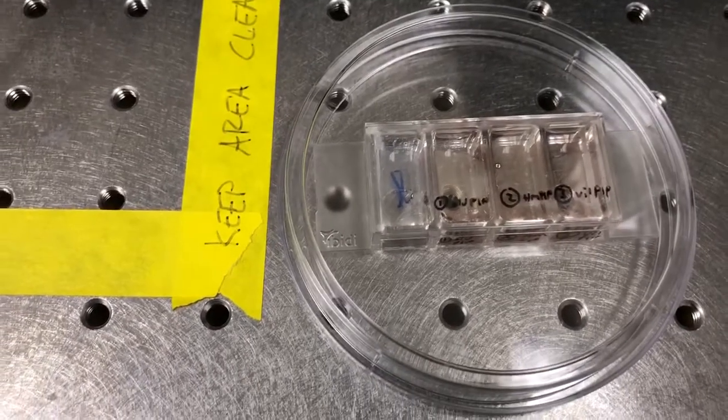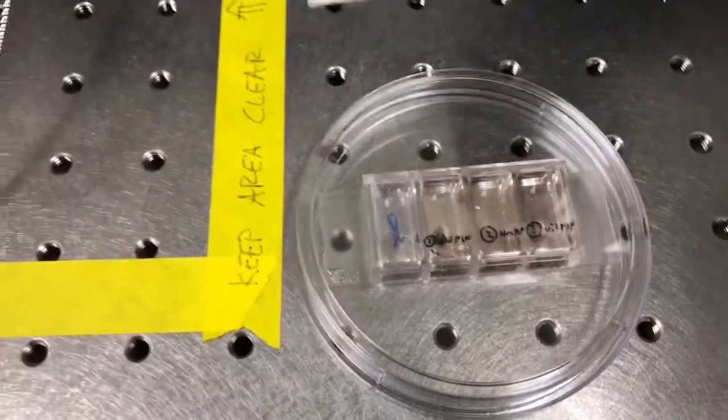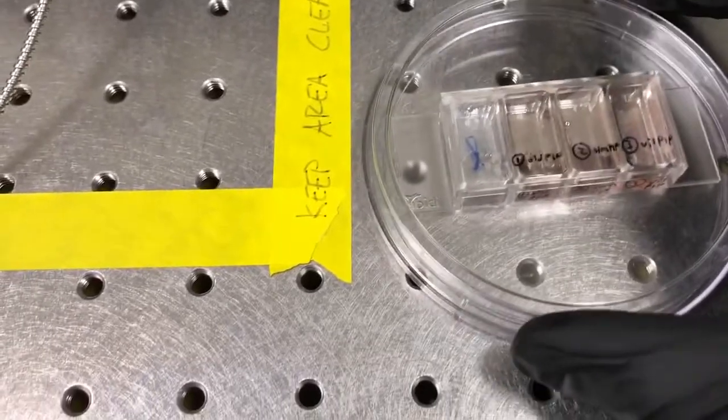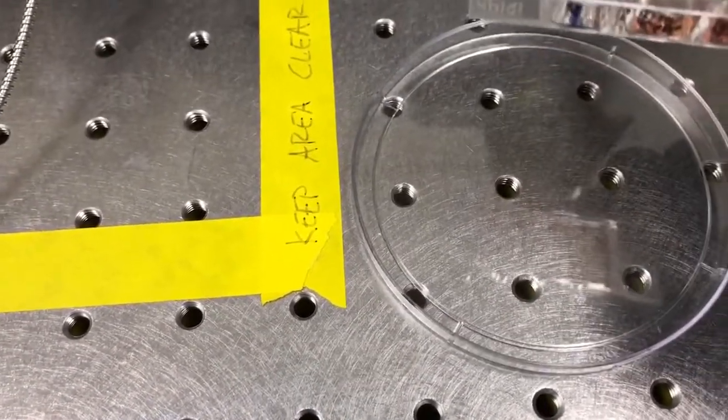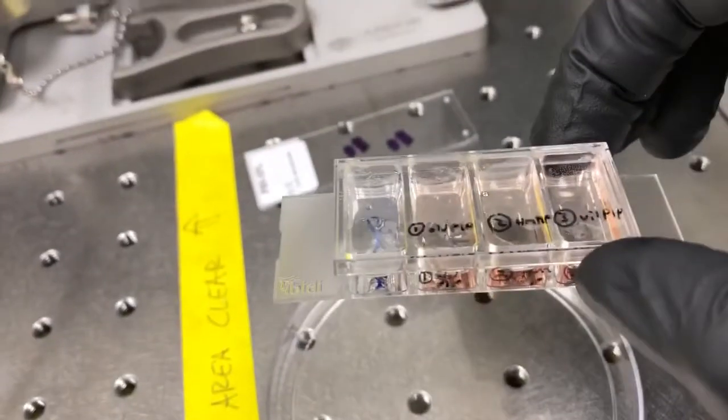What we have here is a sample that's in an ibidi slide. This is a special kind of sample holder where the bottom is very thin plastic. It has optical properties very similar to cover glass.